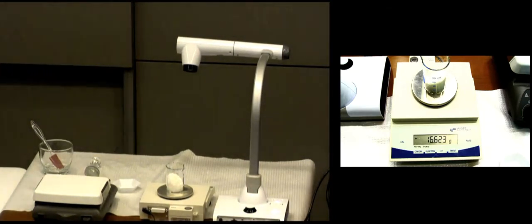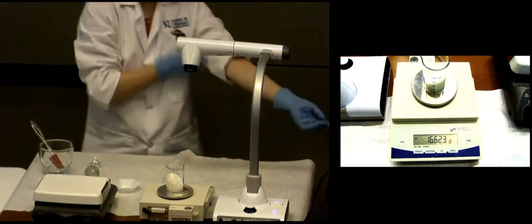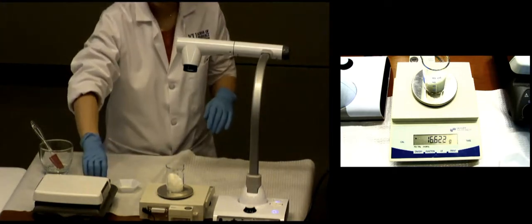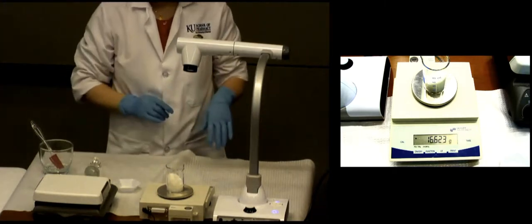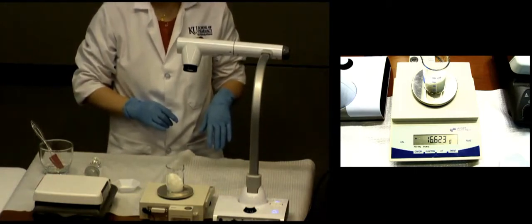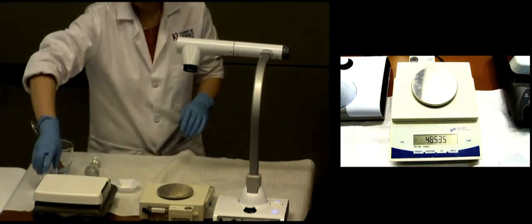Now, why is the fatty base grated? Does it really matter? It doesn't come that way. We had to grate it. Why did we grate the fatty base? Won't it melt either way? But if you have a big chunk and a little chunk, which one melts first? The little chunk. And while you're waiting for the big chunk to melt, what does the already liquefied little chunk do? Polymorph if it overheats. Does it make sense? We want it to melt the same.